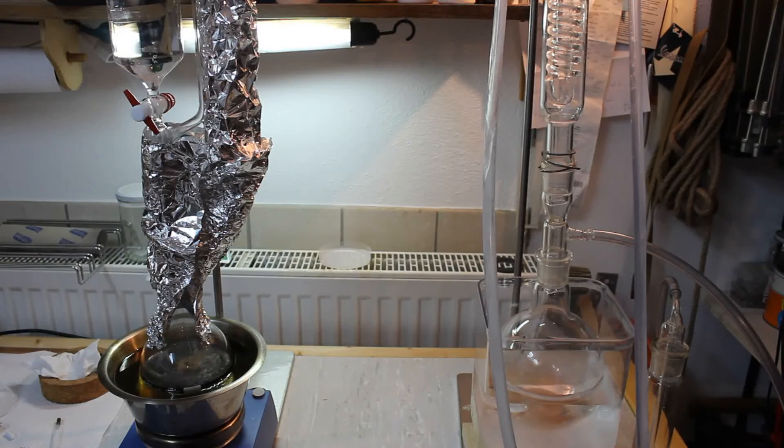I had to insulate the Vigreux column with some aluminum foil since the ether couldn't make it over and I had to overheat the reaction flask thus producing too much ethylene gas.